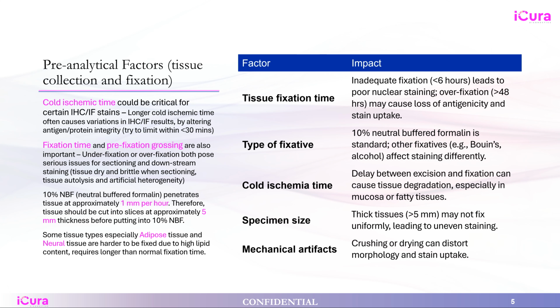In terms of fixation time, many guidelines have given that you should fix the tissue between 6 hours to 48 hours. Of course, you don't want to underfix the tissue with less than 6 hours, but overfixing is as detrimental to the tissue as underfixing. Some of the guidelines say 72 hours is probably fine as well, but we really don't recommend fixation more than 48 hours, especially in smaller tissue size.